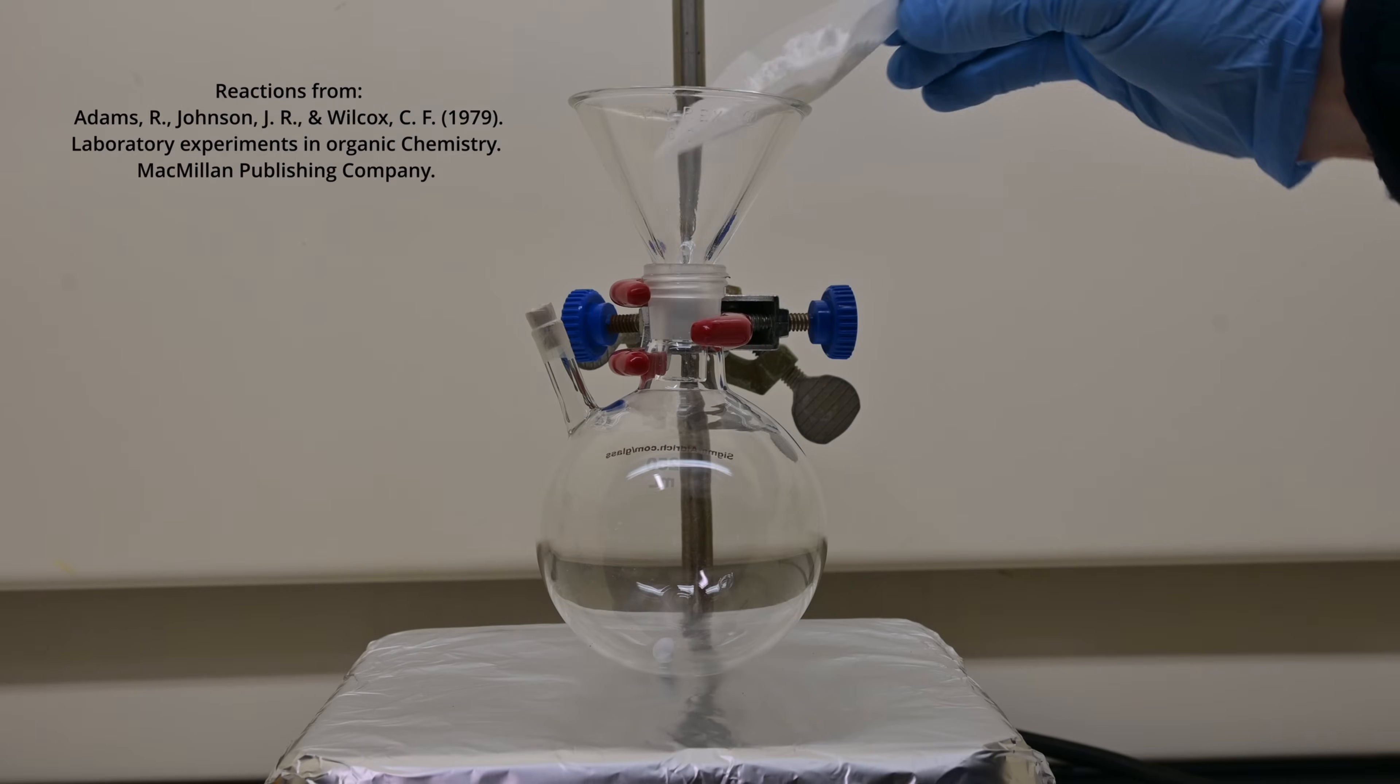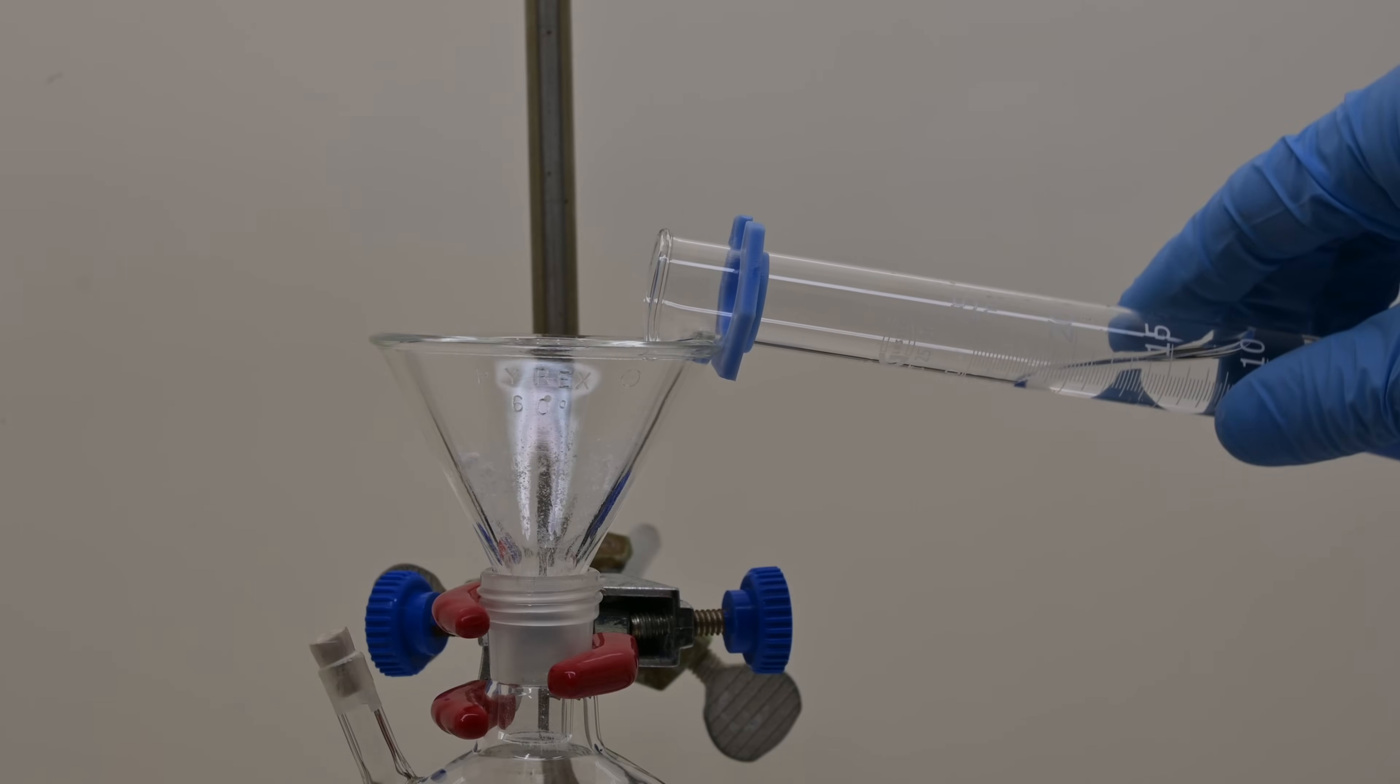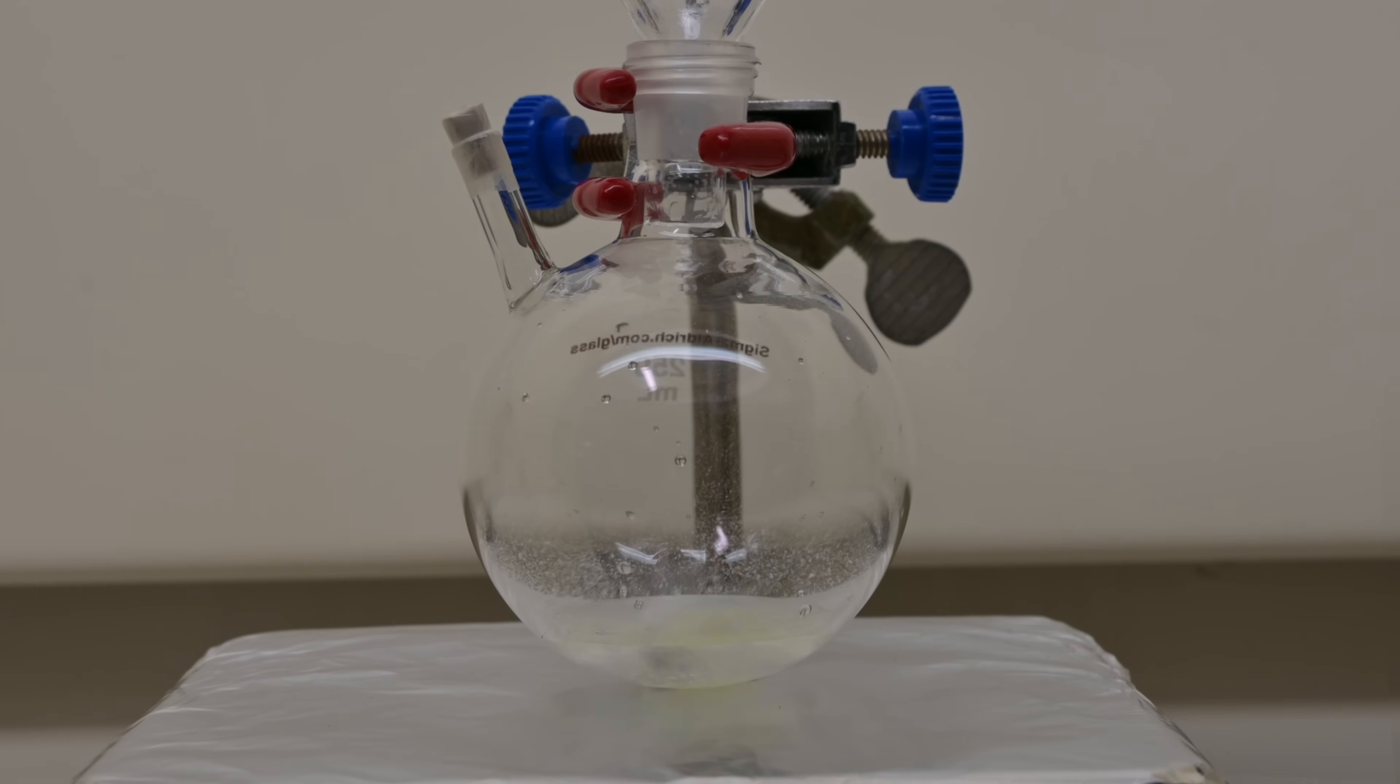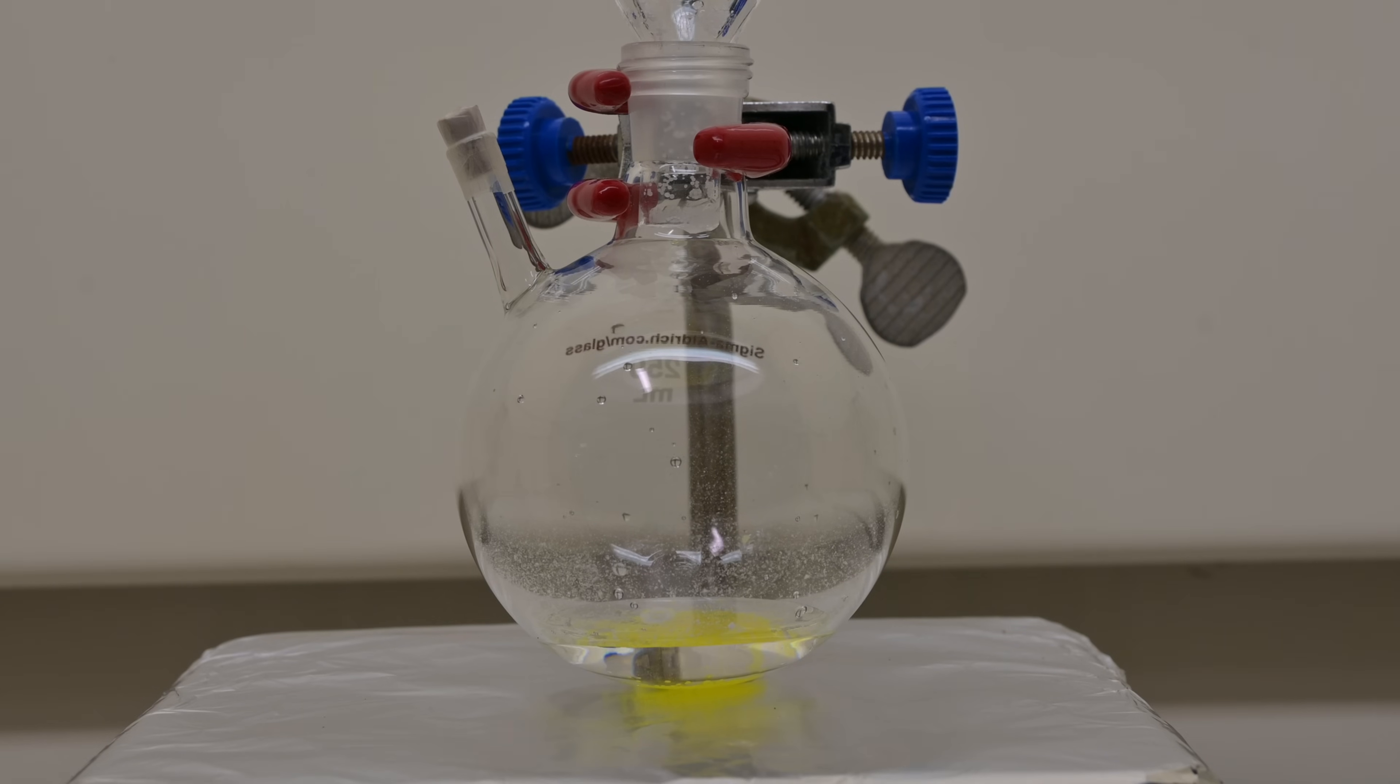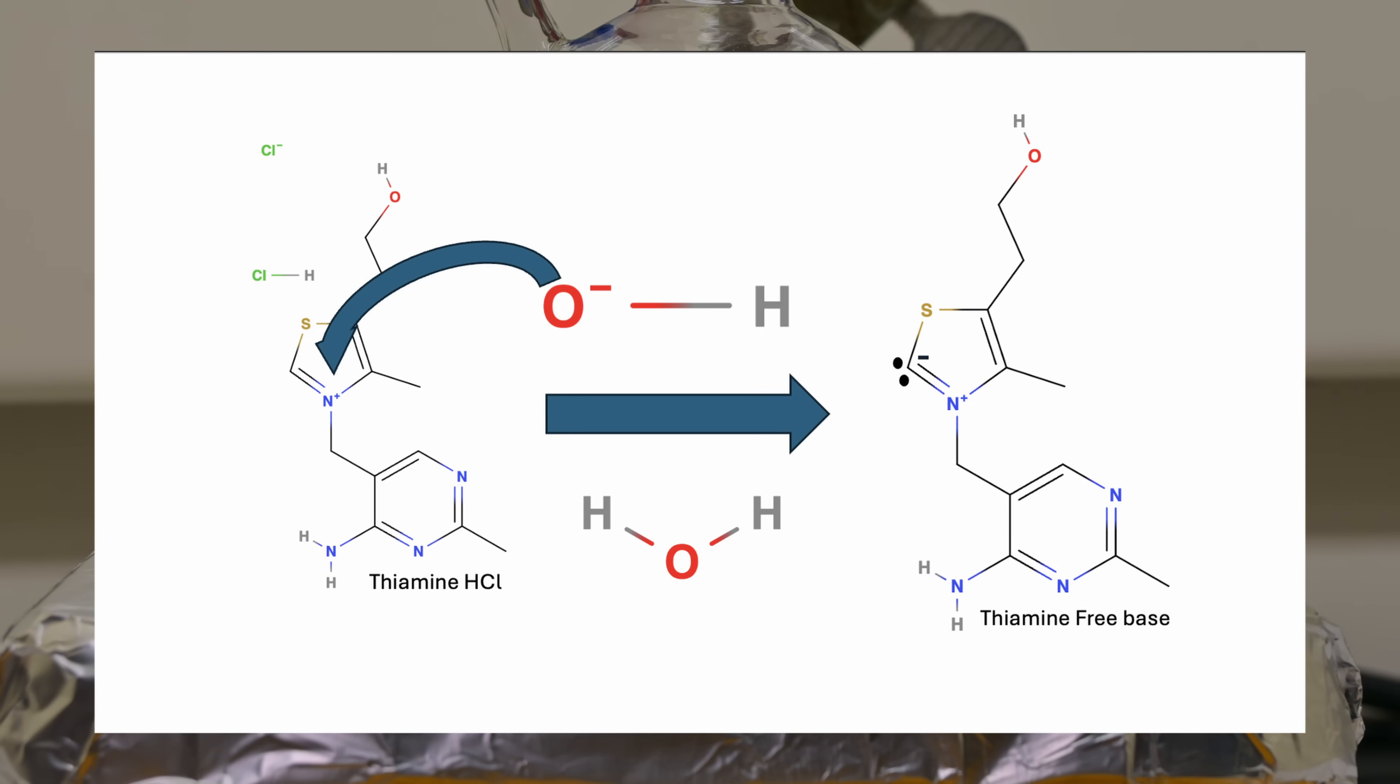The first chemical we are producing is called benzoin. We start this reaction by adding 2.7 grams of thiamine hydrochloride, also known as vitamin B1, with 6 milliliters of 10% aqueous sodium hydroxide into a 250 milliliter round bottom flask. This step converts the thiamine hydrochloride into a more reactive base form. The sodium hydroxide reacts with the HCl, preparing it for the next step of the reaction.